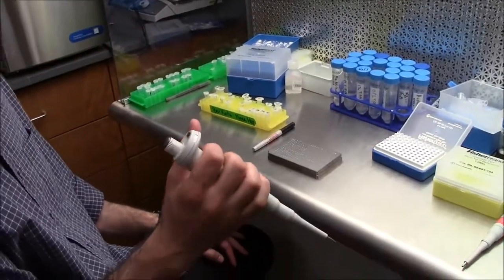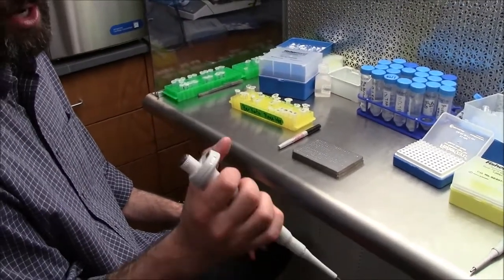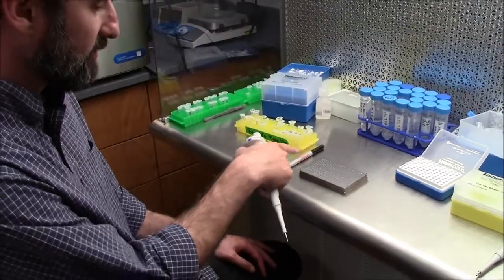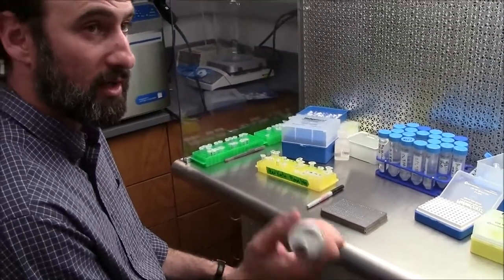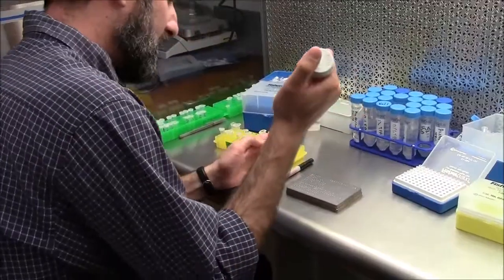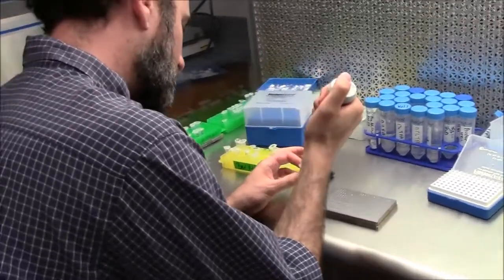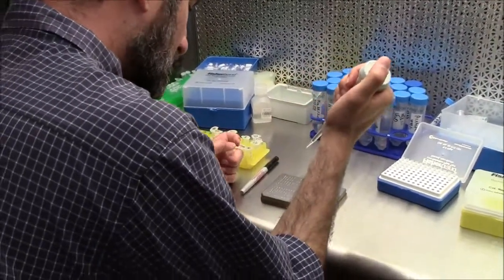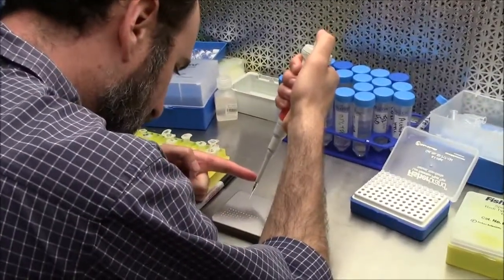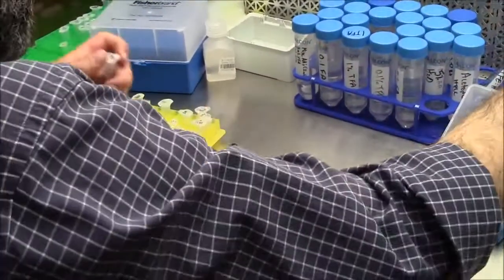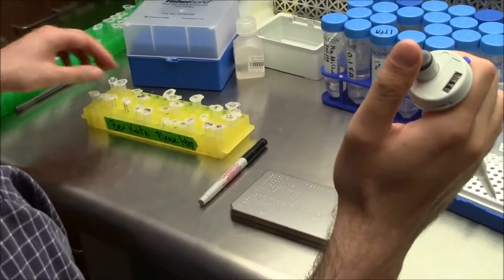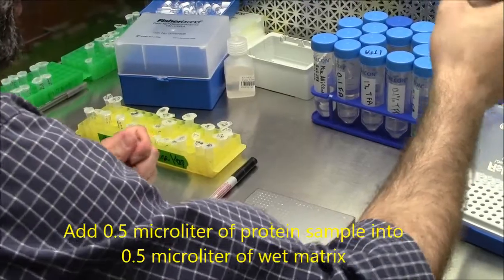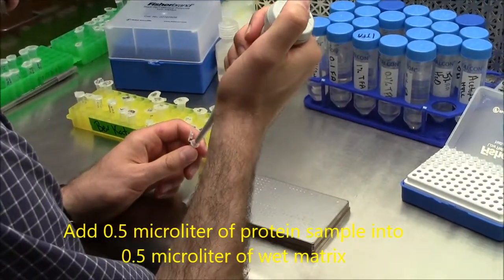I like to spot half a microliter spots because they dry faster. The plates, these plates are coated so they can hold a microliter if you wanted to. So the most important thing is half a microliter of matrix. It's just got to be one to one. And then a half a microliter of your sample into the wet matrix. The order is important.